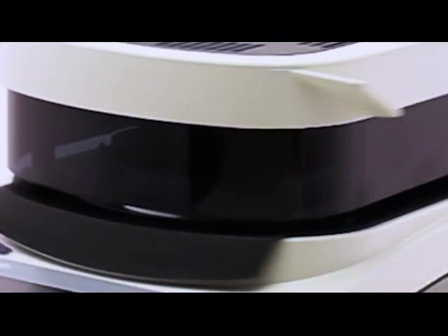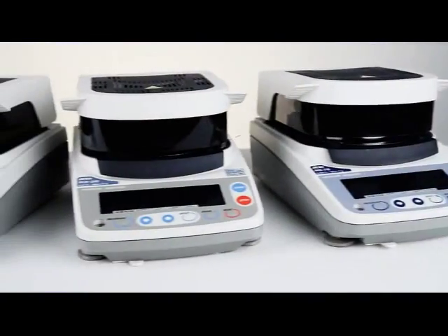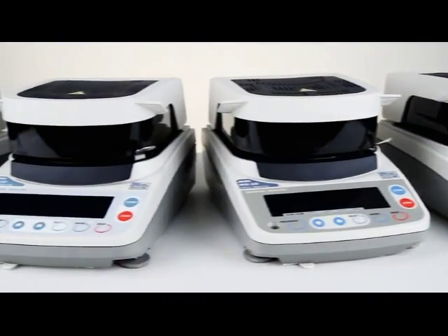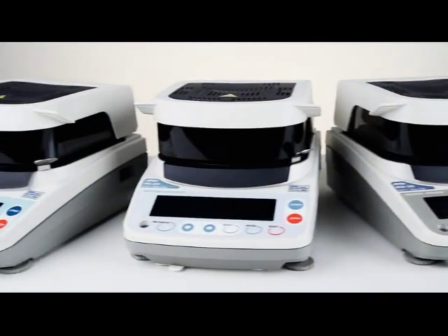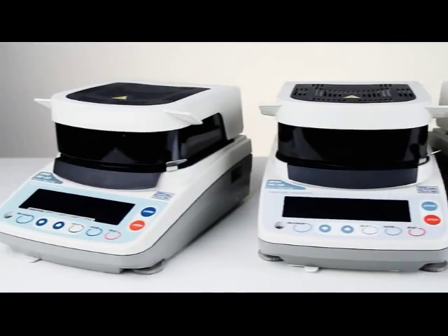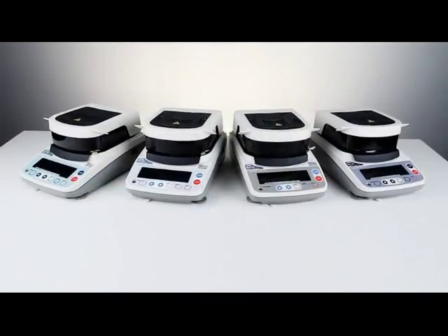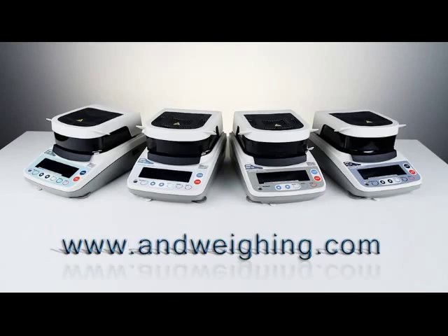Accurate, affordable and fast. The A&D family of four moisture analyzers puts you in control.